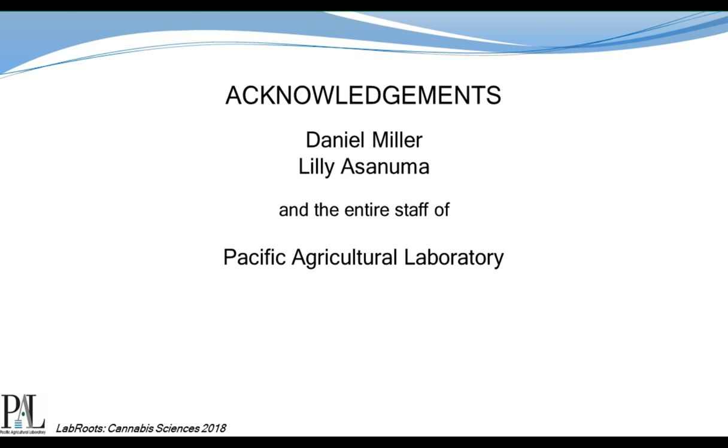Our first question is, do you see a role for time-of-flight mass spectrometry as a semi-targeted qualitative screening method? In this way, unapproved pesticides may be identified, and samples that are positive for approved pesticides can be sent for quantification. Could this help reduce overall workload?